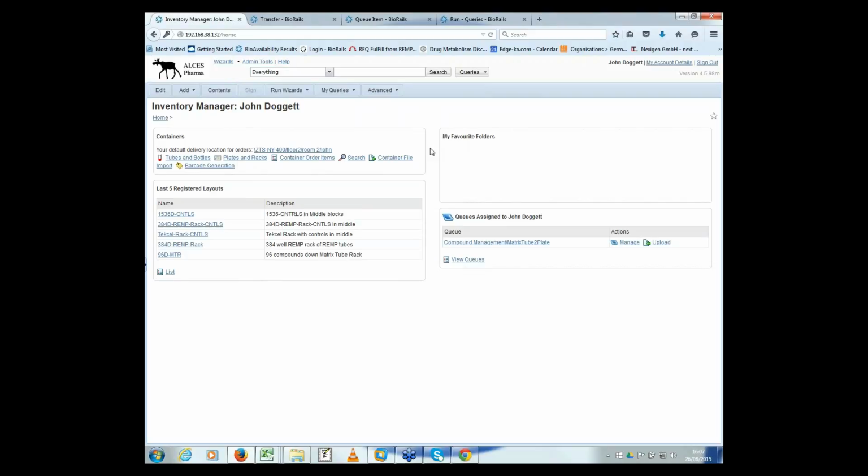Good. Thank you. Can work orders and cherry picks be sorted and configured for manual processing as opposed to an automated tube store? Yep, there is support in it for cherry picking. I didn't show you all of the wizards that are involved, but there are file-based mechanisms as well. So container from file and transfers can be used to do more cherry picking operations. You can pull tubes from standard racks, cherry pick them from the racks, and then prepare plates from those as well.